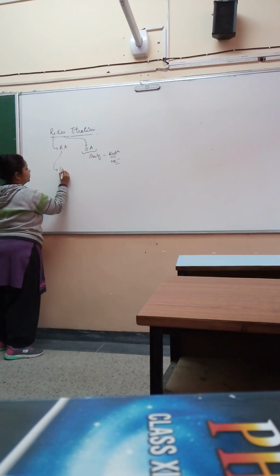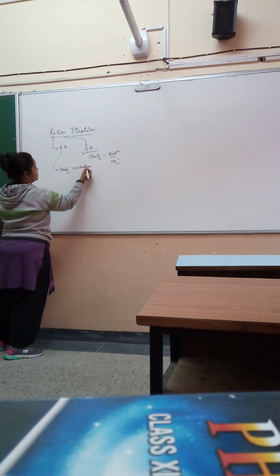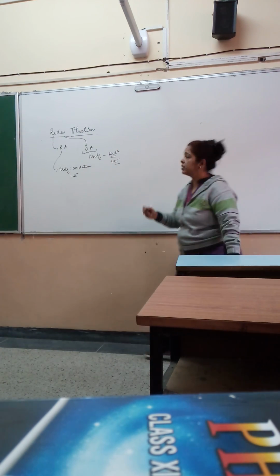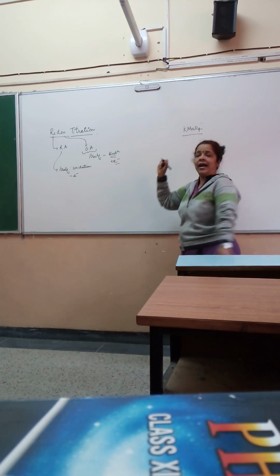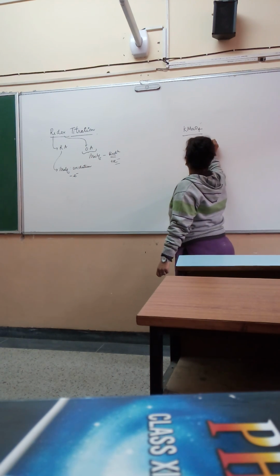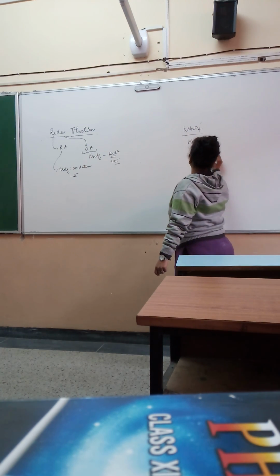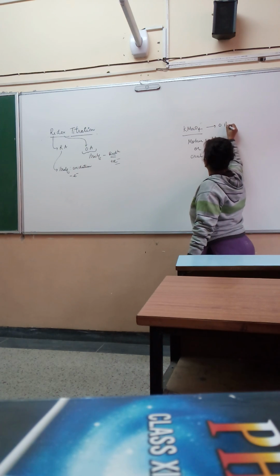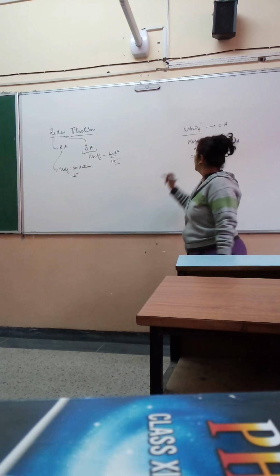So itself undergoes oxidation. Oxidation is loss of electrons. In your titration for class 12, you have got KMnO4 in both the titrations acting as an oxidizing agent, and Mohr salt or oxalic acid as the reducing agent. Therefore, this is your oxidizing agent in the titration, while these are your reducing agents in the titration.